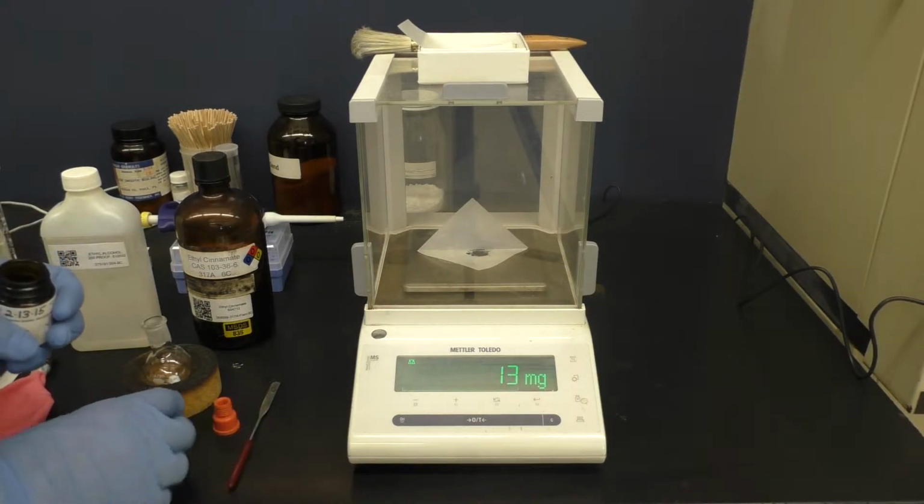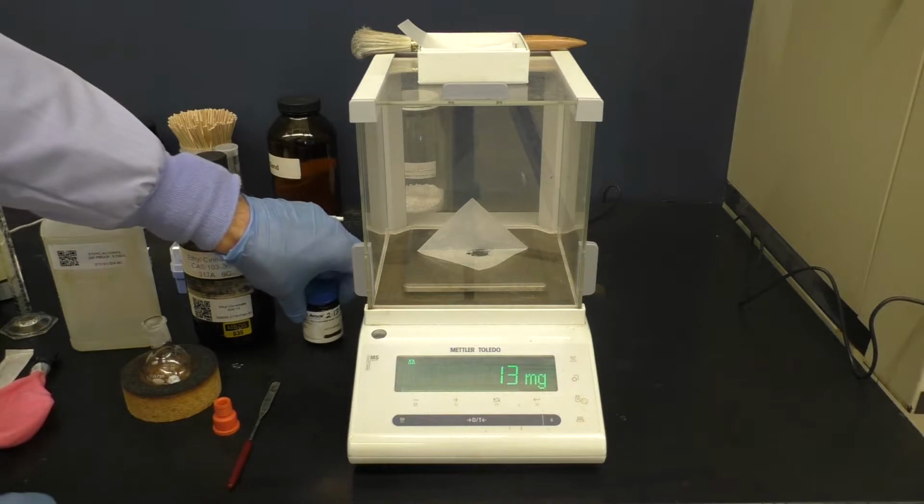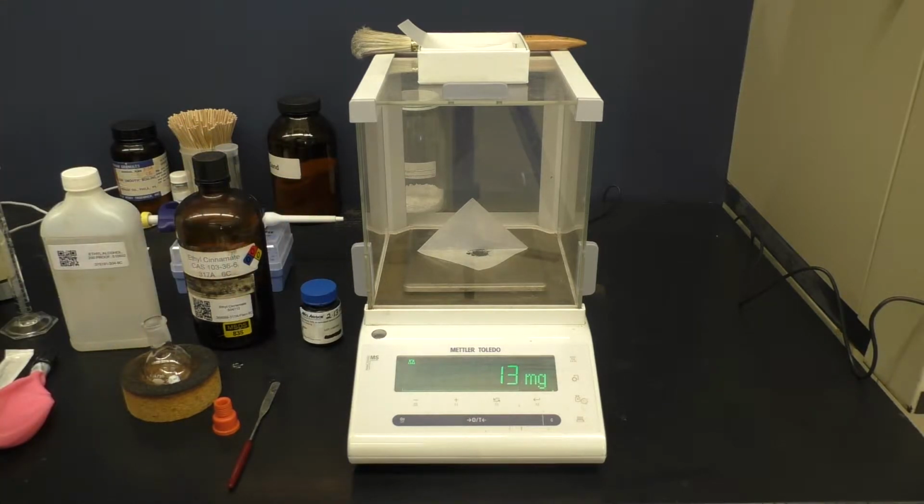All right, so a little bit over what I need, but 13 milligrams is close enough, and since it's only acting as a catalyst in this case, 13 milligrams is sufficient. We'll take this and add it into our reaction flask now.